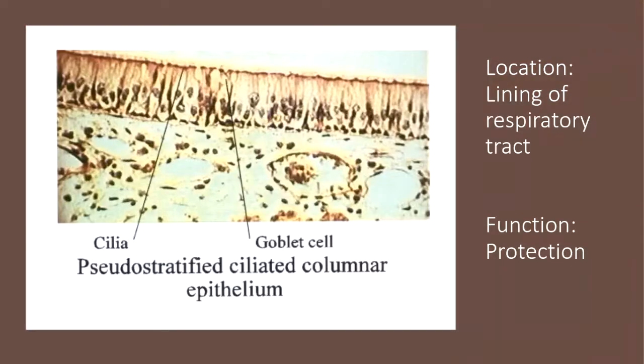Here's a special example of layers. Pseudo-stratified: kind of stratified, looks a little bit, but maybe not stratified. And that's really what it means. When we look at these cells, let's use this one for example. Here's a nucleus. Down here is the bottom. Here's the basement membrane. And if we go through here, there's only one cell layer thick, right? But whenever we look at this further back, the nuclei are stacked on top of each other. So it almost looks like stratified tissue, stratified cells, but these are actually a simple epithelium. And so because it looks stratified, but it's actually simple, we call it pseudo-stratified.